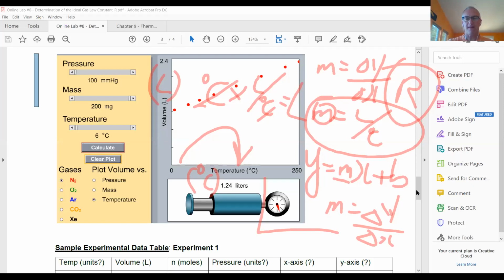Should automatically give you the R squared. It should give you one. How will we know, when we plot some combination of data on X and Y, how will we know when we actually have the value of R in our slope? How will we know that?